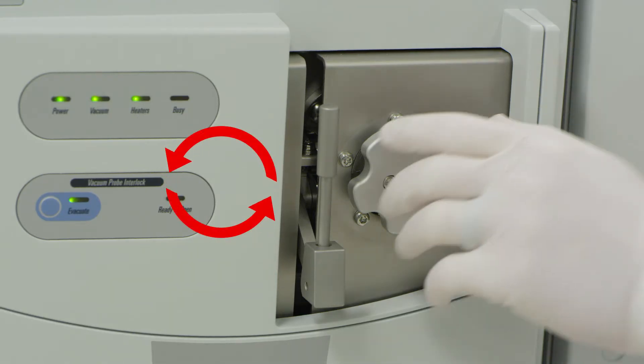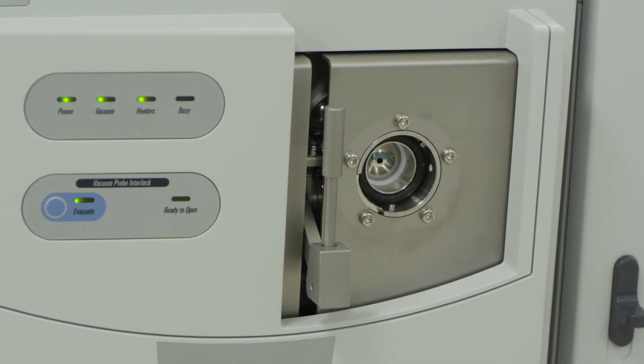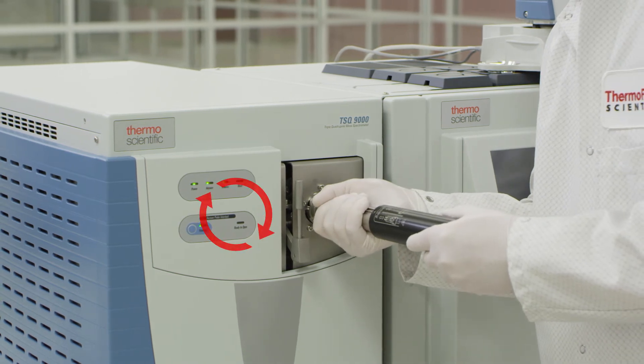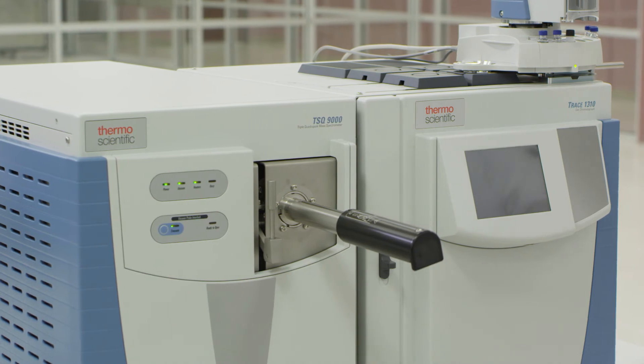Remove the manifold cap by turning it counterclockwise. Insert the source installation tool and turn clockwise to lock the tool in place, but do not push the tool forward. Doing so will damage the instrument.